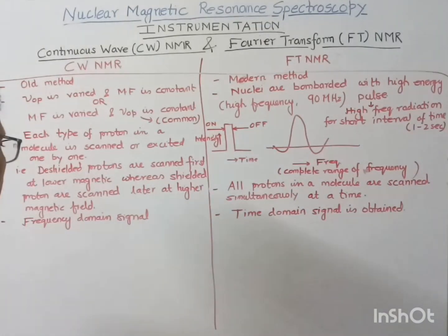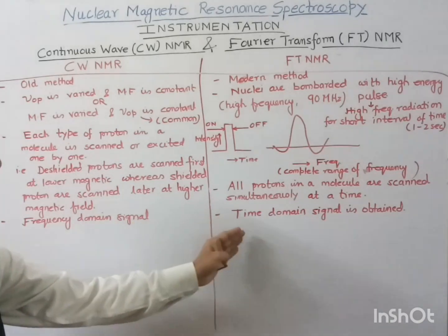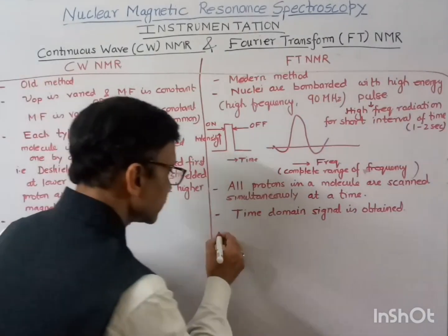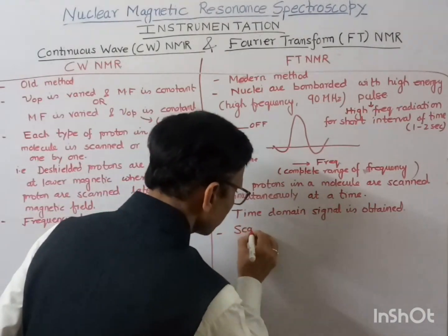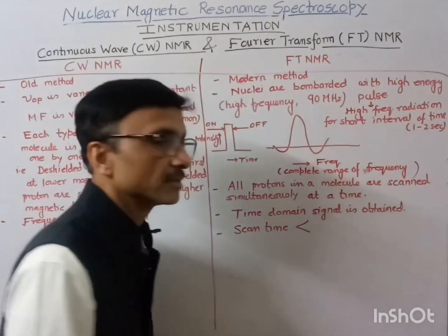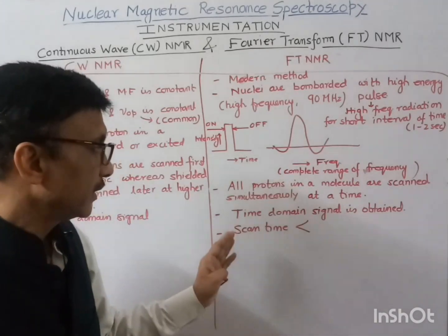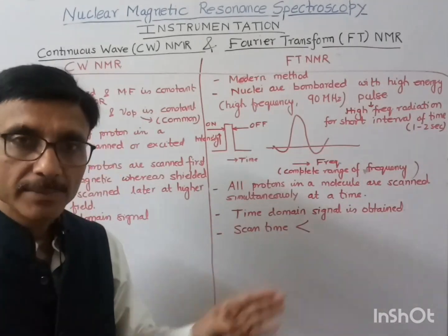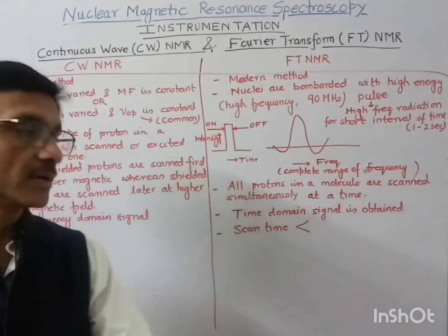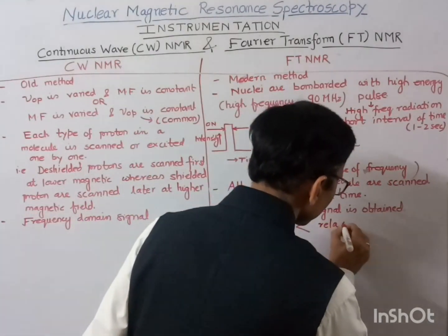Another very important thing is that here the scan time is very less, because all protons are scanned simultaneously. First scanning is complete, then relaxation occurs. So scan time is less than the relaxation time.